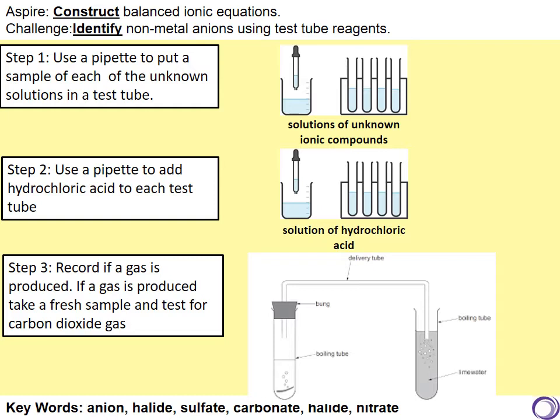If they are, then you can take a fresh sample and collect the gas using a delivery tube and bubble that gas through lime water. If the gas is carbon dioxide, then the lime water will turn cloudy as a positive test.